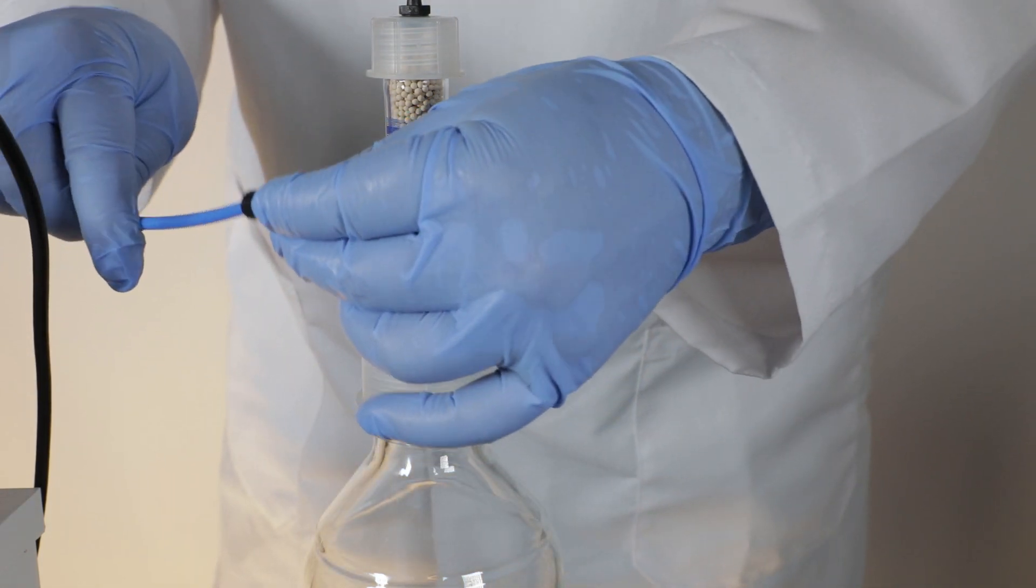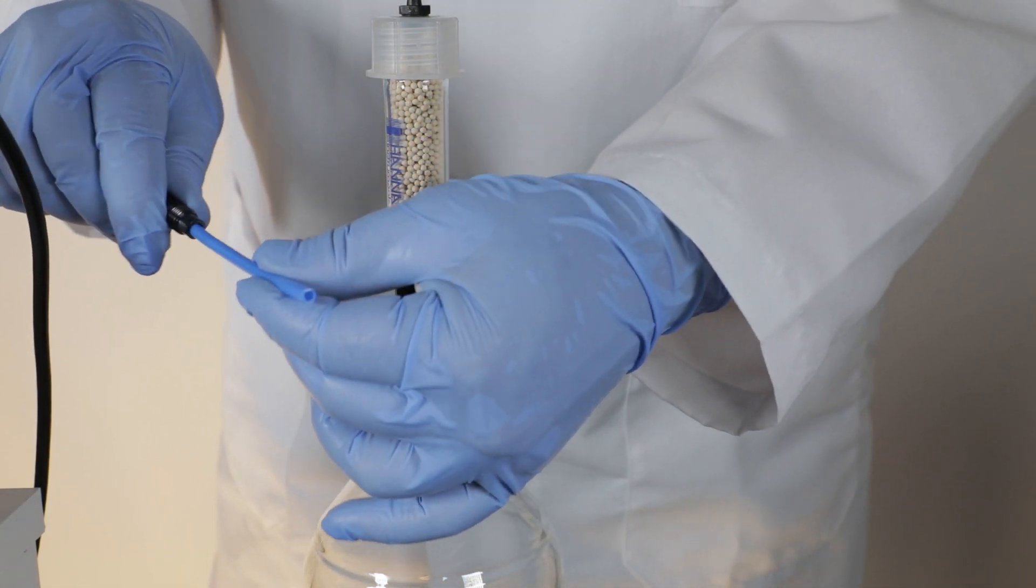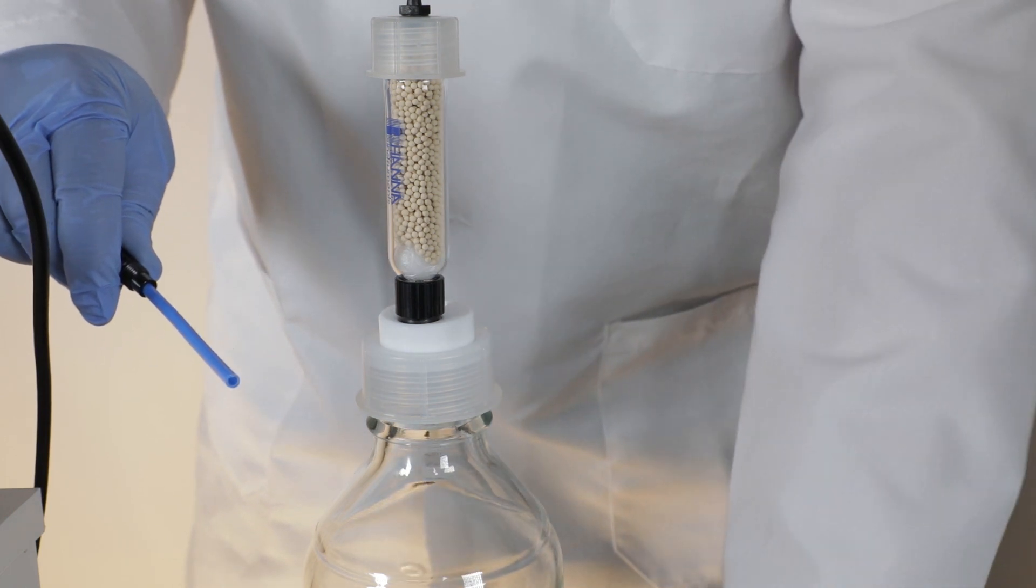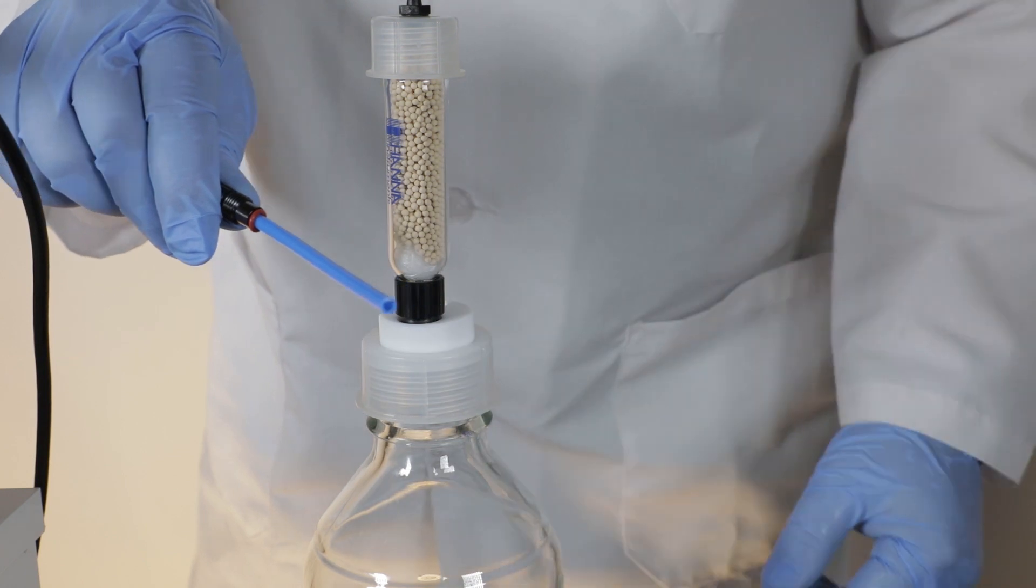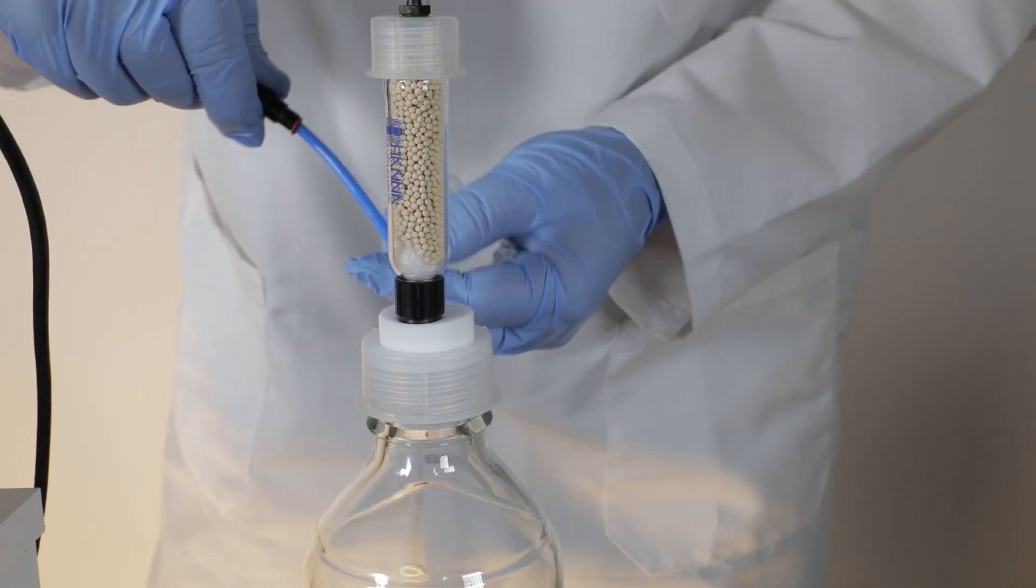Now, insert the tubing from the right side port on the reagent exchange adapter into the 5mm fittings and red O-ring. Push the tubing down into the waste bottle and screw the fittings tight onto the bottle top.